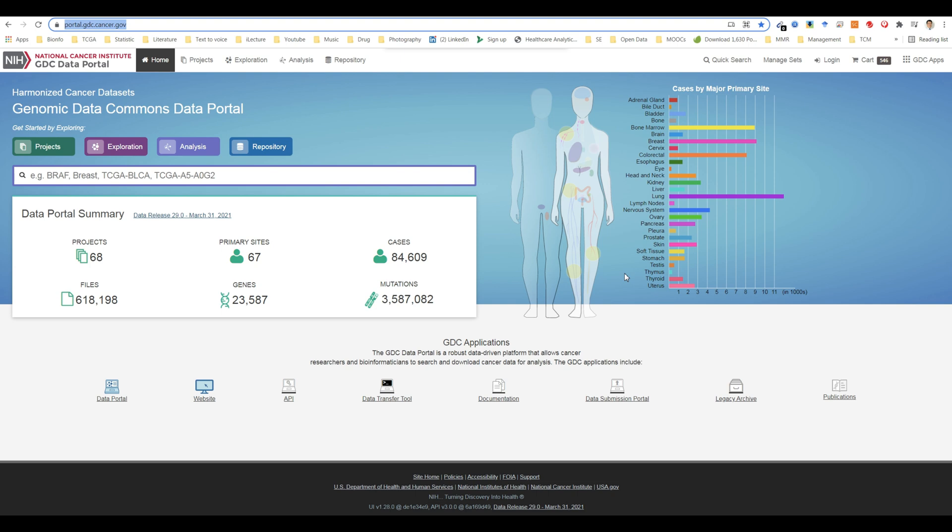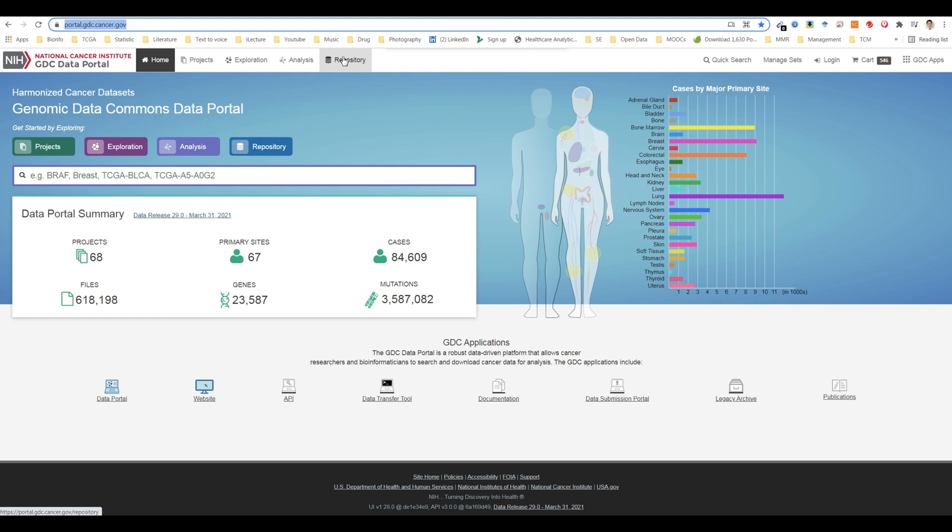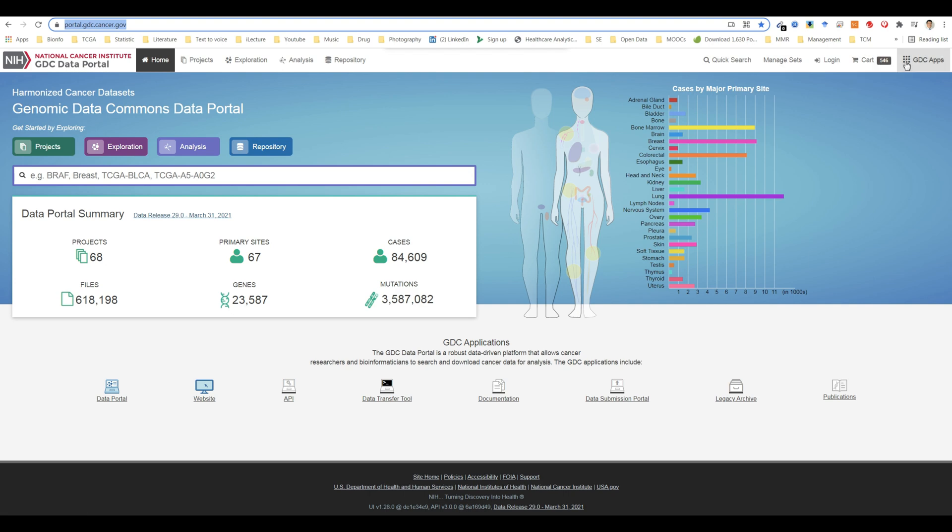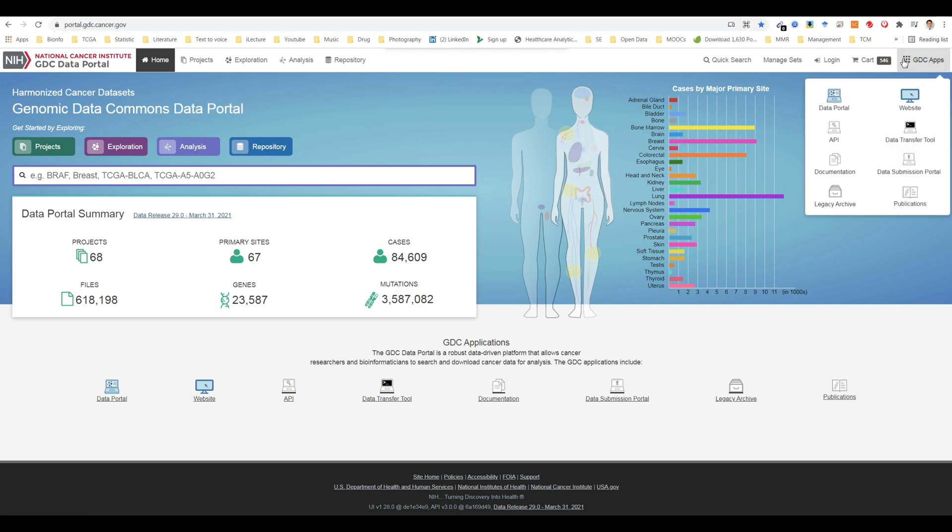The toolbar available at the top of all pages in the GDC data portal also provides convenient navigation links and access to authentication and quick search. The left portion provides access to the home page, projects page, exploration page, analysis page, and a link to the repository page. The right portion provides access to quick search, manage sets, authentication functions, the cart, and the GDC apps menu.